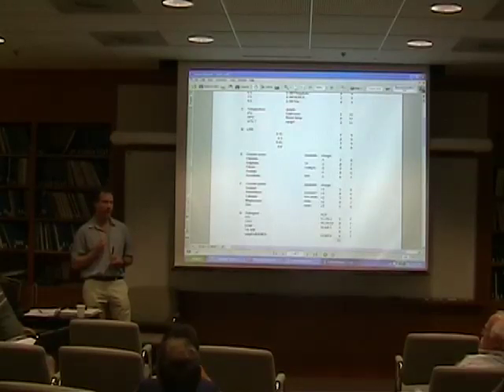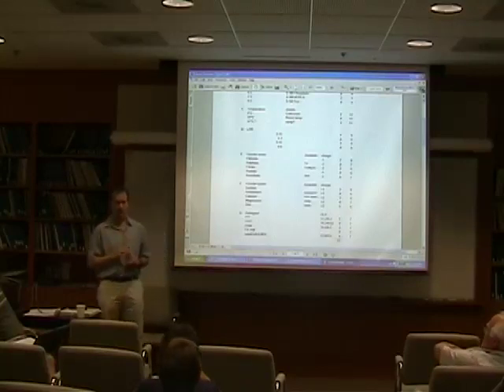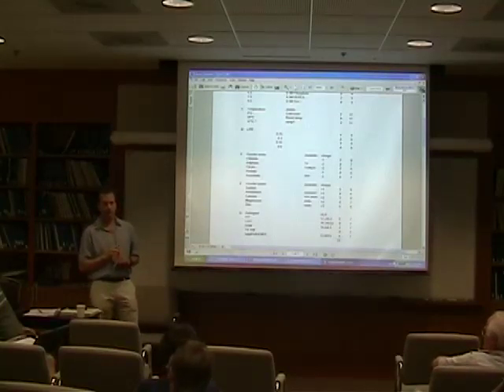It doesn't have to be in a day. Well, with different protein preps, your LPRs are off. Why can't you just grid them and put the names down and look at the samples the next day? No. You can't get everything together. You can't always purify a protein to do 35 samples at once.